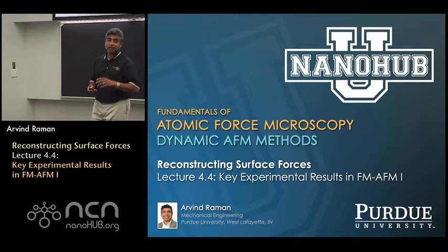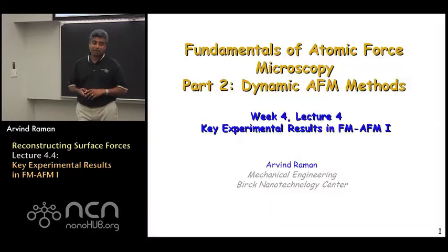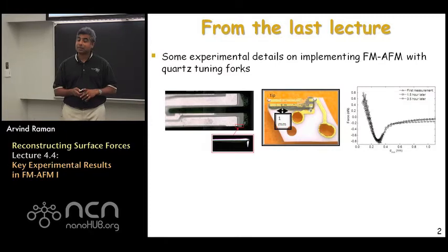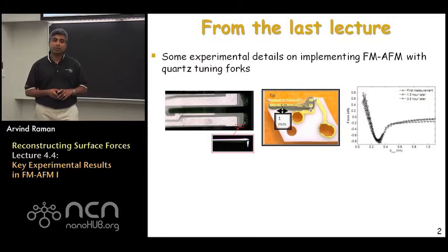nanoHUB-U, online instruction. Hi, and welcome to week 4, lecture 4 of dynamic atomic force microscopy methods. In the last class, we'd been talking about the quartz tuning fork sensor and how it provides an alternate platform to achieve high-resolution AFM and force spectroscopy in addition or in complement, let's say, to the traditional silicon-based cantilever probes.